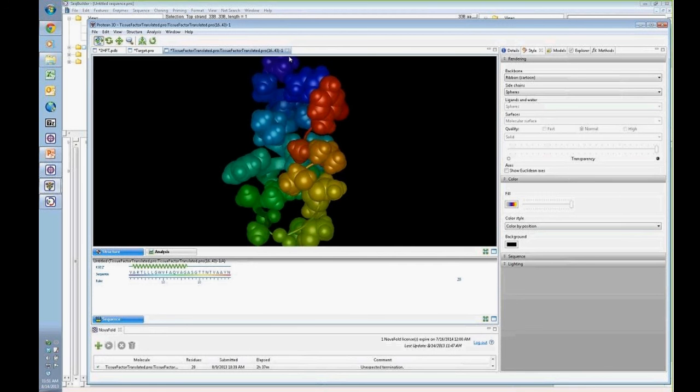Basically, when analyzing the protein, if you've discovered an enzyme or a protein of interest that does something unique, the end result typically is that you're going to crystallize it so you can take a look at the three-dimensional image. So what we've done here is incorporate a tool that allows you to create a three-dimensional image, but it utilizes a very accurate algorithm that does that without having to go through all those steps that would crystallize a structure. Those are some of the logical steps that you could think about when you're working with a cloning, expression, and primer design type of project.